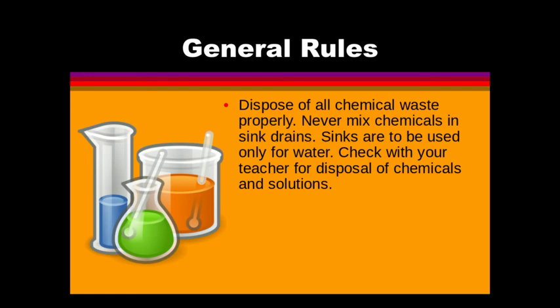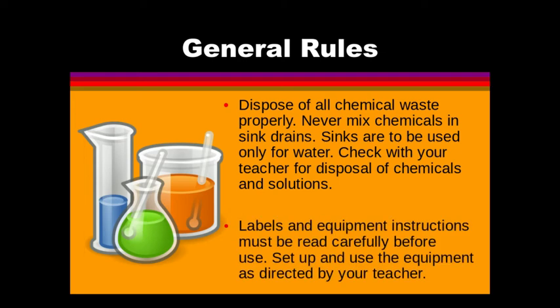Dispose of all chemical waste properly. Never mix chemicals in a sink. Sinks are used for water only. Check with your teacher for disposal of chemicals and solutions. So I will have a waste bucket.